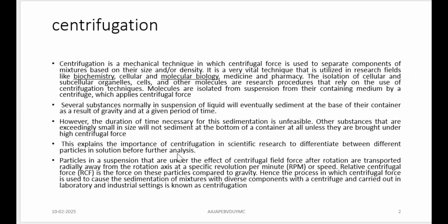Now, when we are talking about centrifugation as such, the rotation axis, specific revolutions per minute, and the time are the three factors which are very important. So we are talking about the properties of the material which is under sedimentation. What is included in that? The size, the density, right? And the second part is that of the machine. In that case, what is the centrifugal force or centrifugal field that is applied? What is the time given?